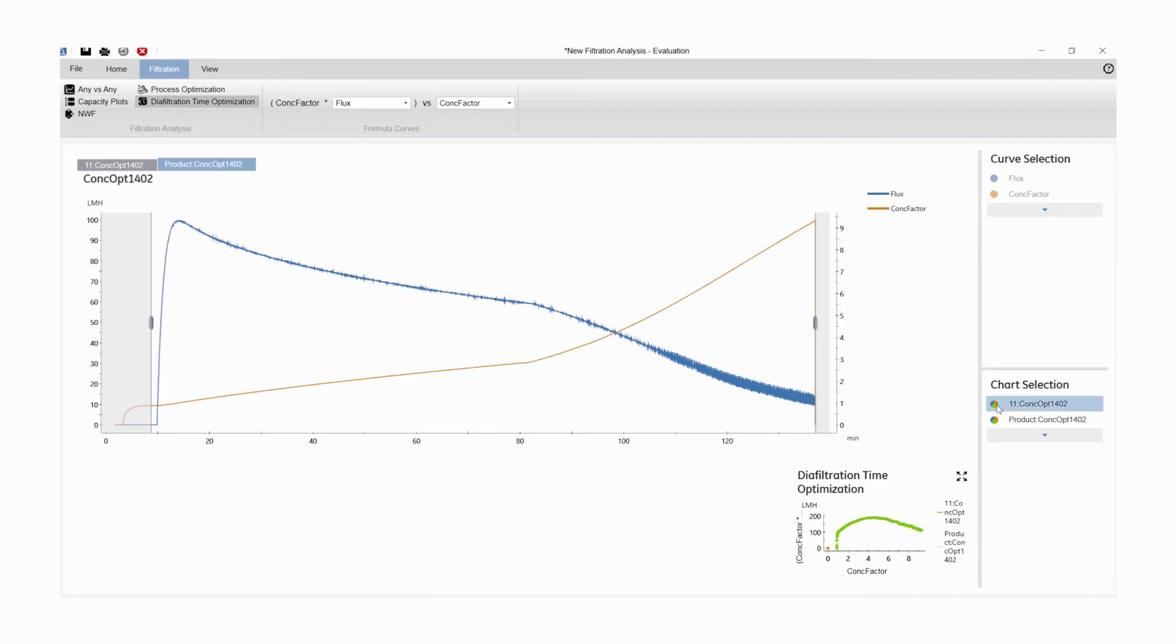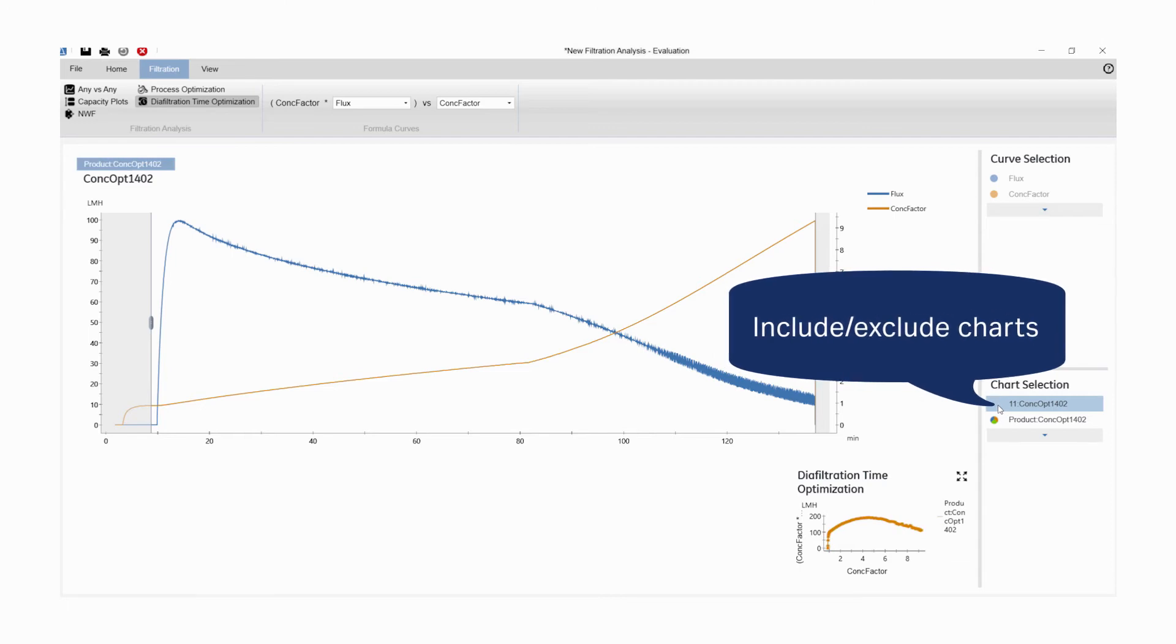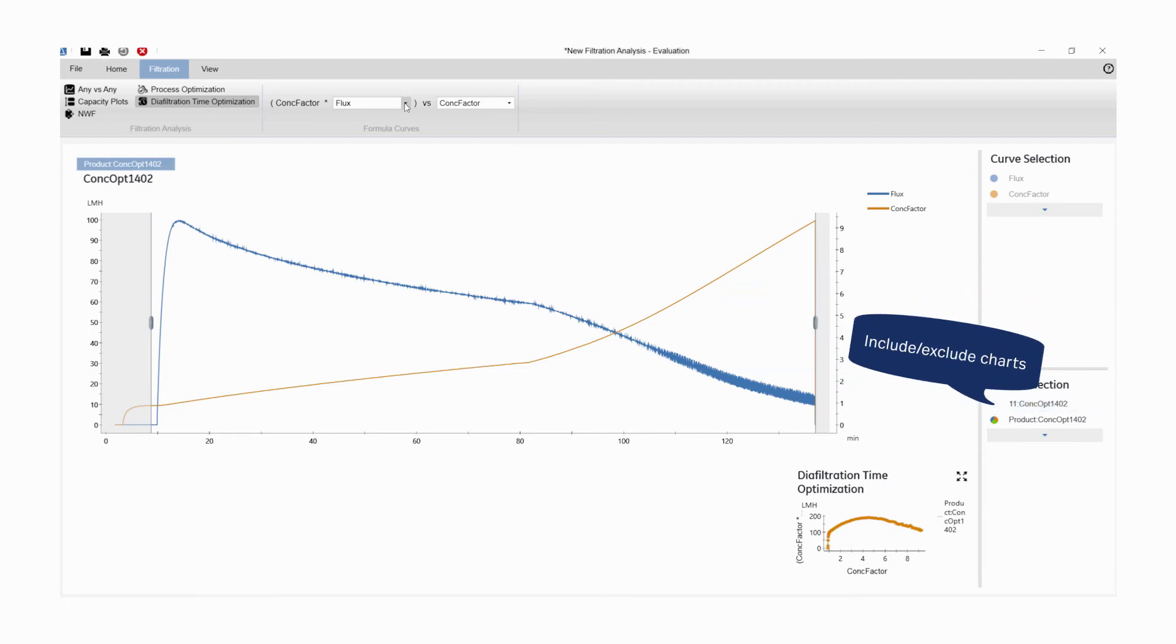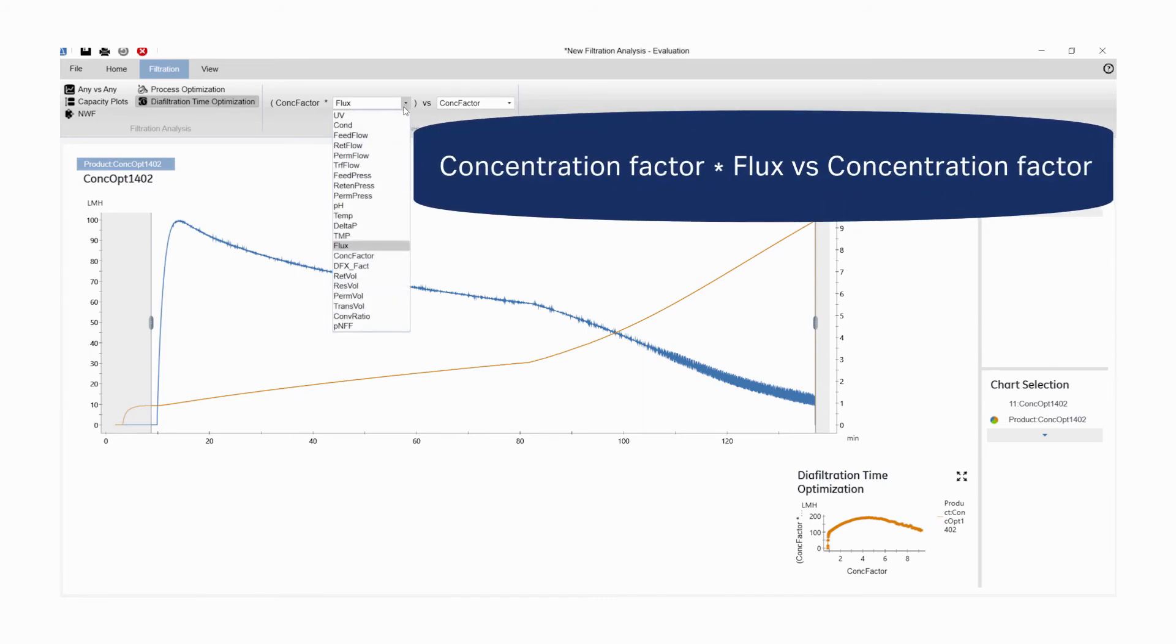Charts can be included or excluded for analysis from the Chart Selection pane. Select the curves you wish to analyze. In this case, we want to compare concentration factor times flux versus concentration factor.